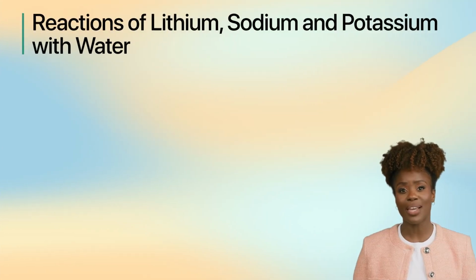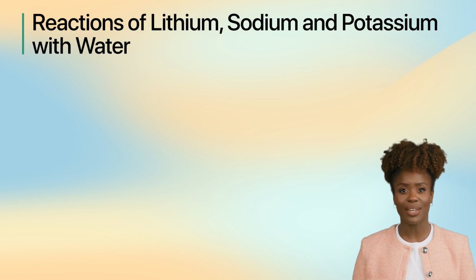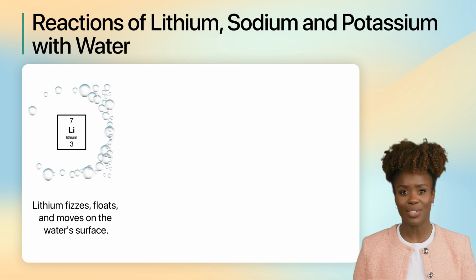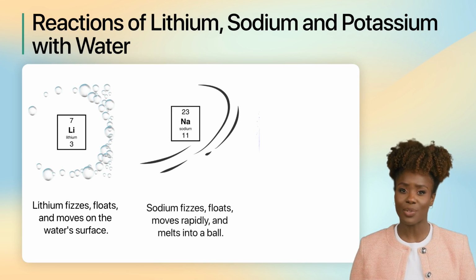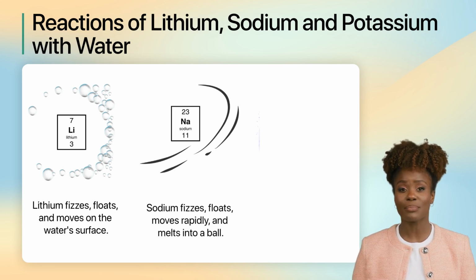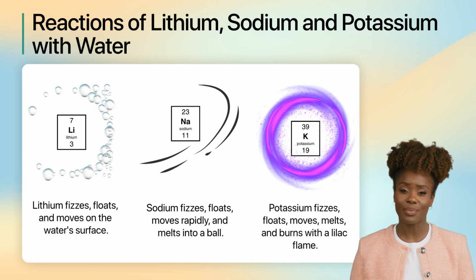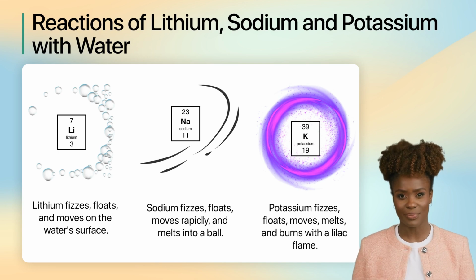Here's what happens when each of these metals reacts with water. Lithium fizzes, floats, and moves on the water surface. Sodium fizzes, floats, moves rapidly, and melts into a ball. Potassium fizzes, floats, moves, melts, and burns with a lilac flame.